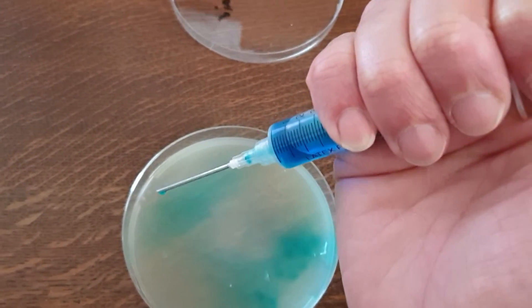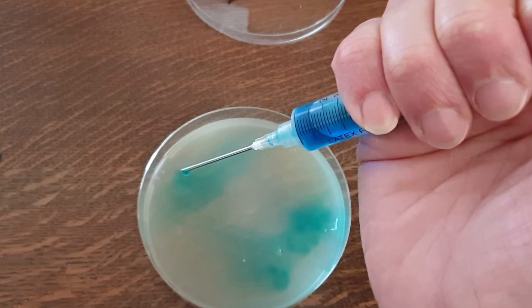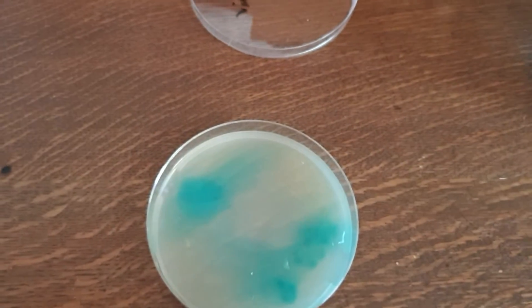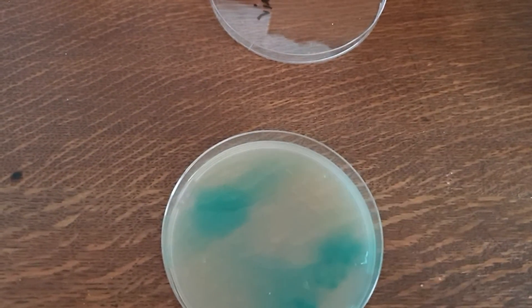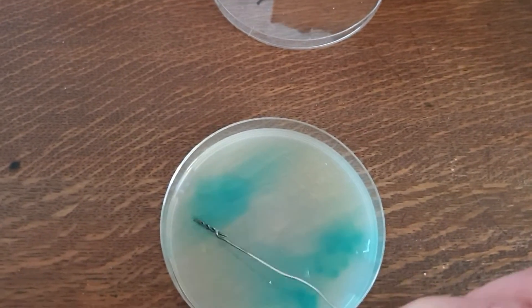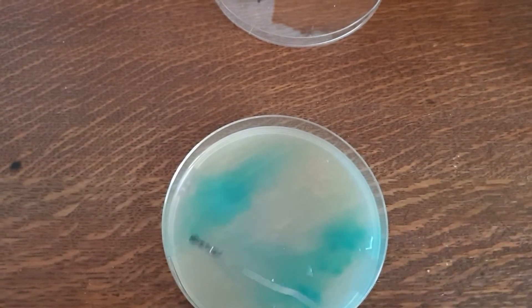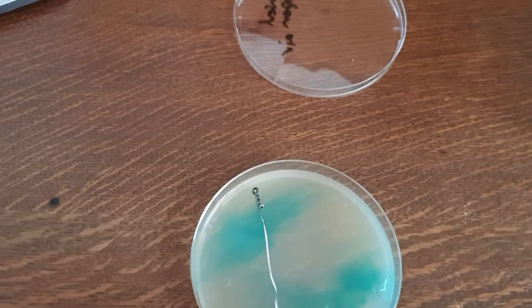Pop a drop in the corner of your solution — there it goes. Then you take your inoculation loop, which again would be sterile. This is my homemade one. And you streak across the top — that's your first streak.